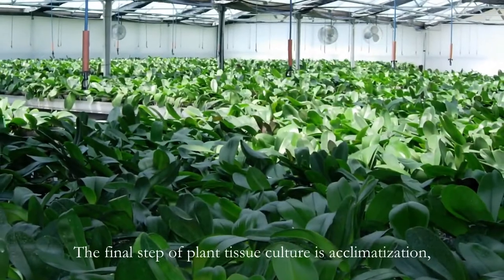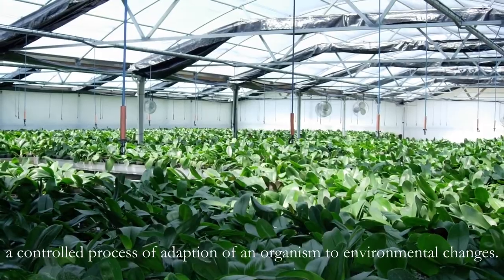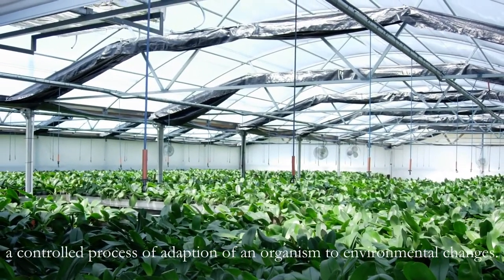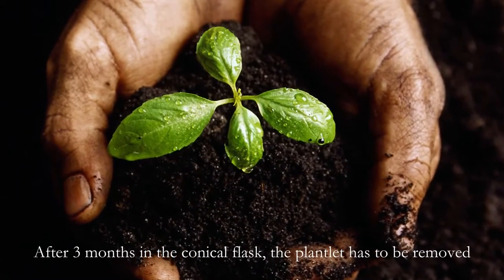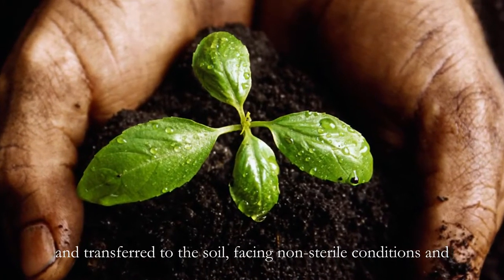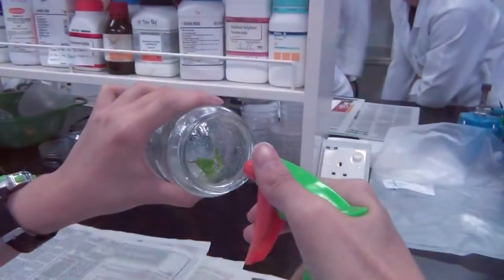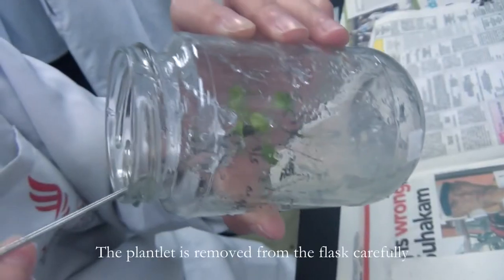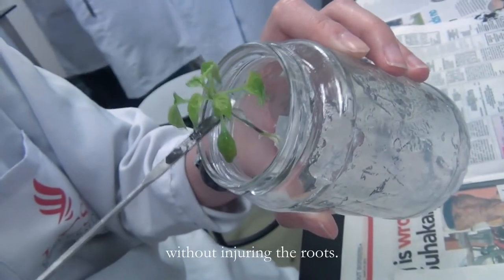The final step of plant tissue culture is acclimatization, a controlled process of adaptation of an organism to environmental changes. After three months in the conical flask, the plantlet has to be removed and transferred to the soil, facing non-sterile conditions and inconsistency in humidity and temperature. A little water is first added into the flask to soften the agar. The plantlet is removed from the flask carefully without injuring the roots.